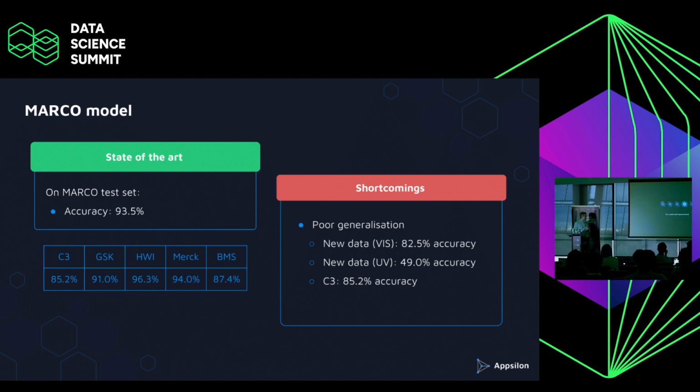And then in these 2 extra data sets, the Viz and UV, if I remember correctly, it's actually balanced there, I think. Those data sets are quite small. It's roughly 3,000 crystals and 3,000 non-crystals, if I remember. Well, maybe the data set itself is more, but we downsampled the other classes because we only need roughly the same, right? All right. And in real life?